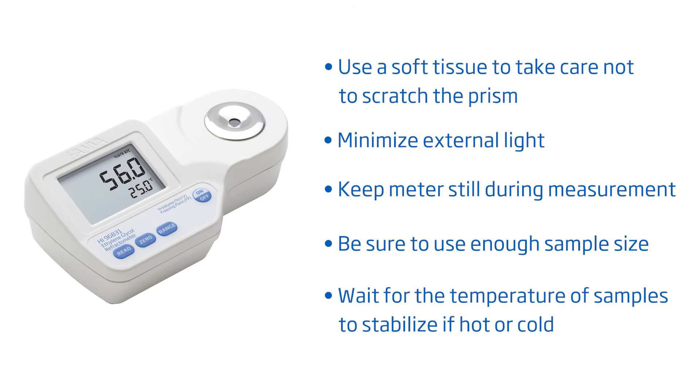Take care not to scratch the prism. Minimize external light. Don't move the meter during measurement. Make sure to have a sufficient sample size and no bubbles on the prism. Wait for the temperature to stabilize if your sample is hot or cold.